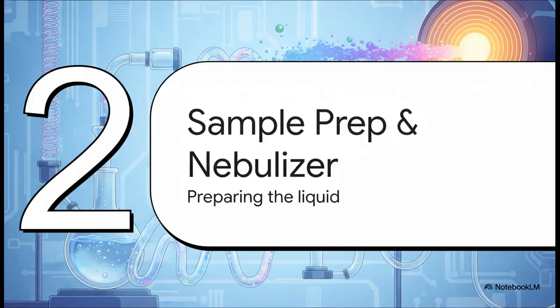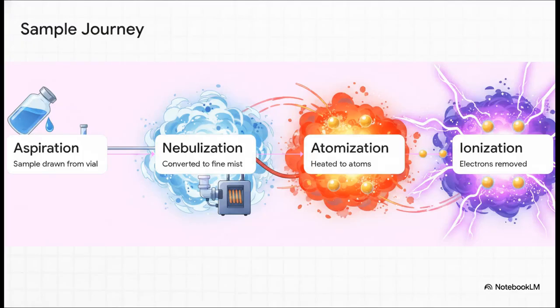Section 2. Sample prep and nebulization. Preparing the liquid. Let's step into the present-day lab. Our sample usually starts its journey in liquid form. Maybe it's environmental water or a digested biological sample. But to actually be analyzed, it needs to get airborne.